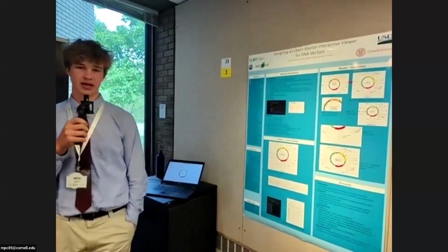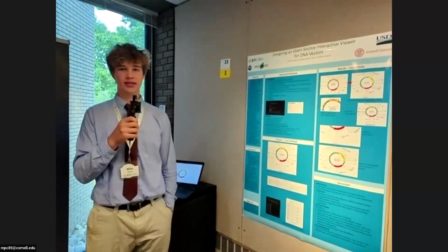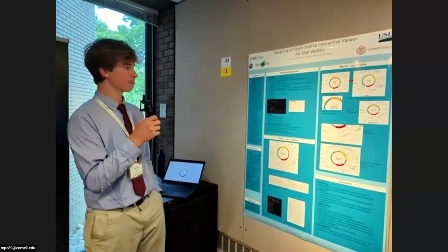for complex genetic data. So my project aims to fix that by building a user-friendly, interactive DNA vector viewer to enhance data interpretation in plant breeding research.